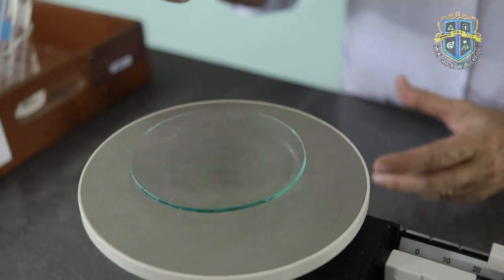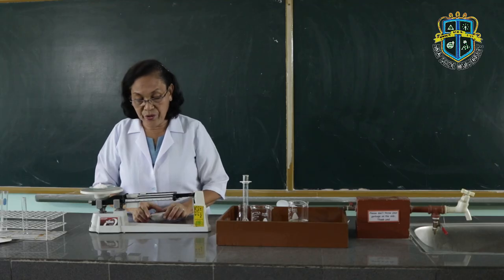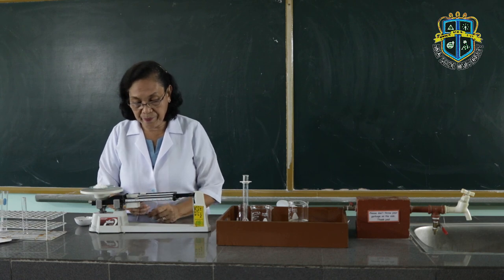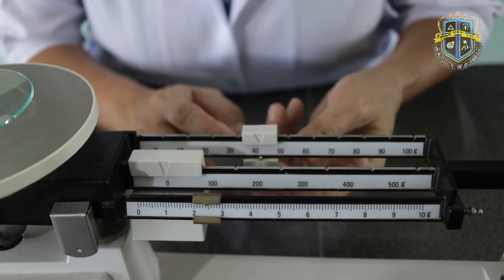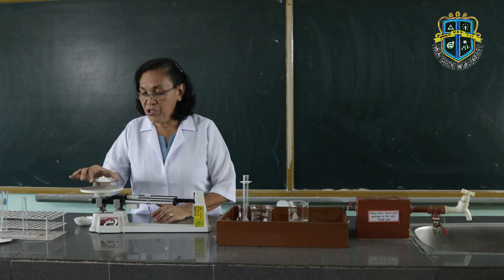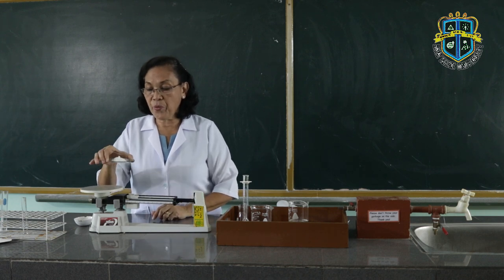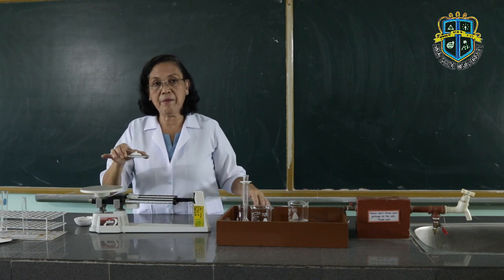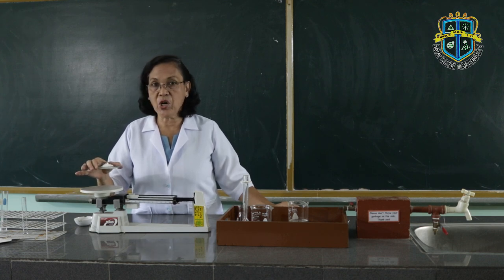Now we are going to place this table salt onto the watch glass. We expect that the weight becomes greater, so we have to adjust the riders. If you look at the reading, it is marked 45 grams. So the mass of the table salt, therefore, will be the difference between the mass of the watch glass with the table salt minus the mass of the empty watch glass. That is how to measure the mass of substances.